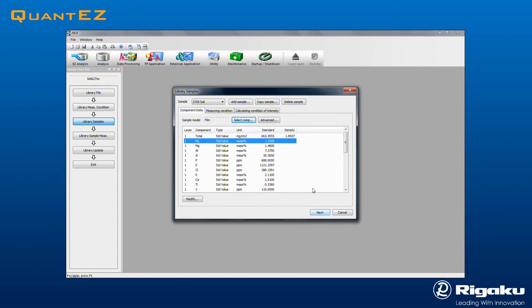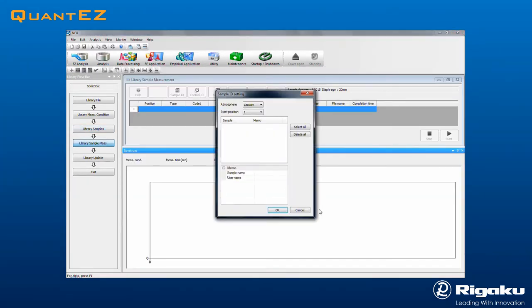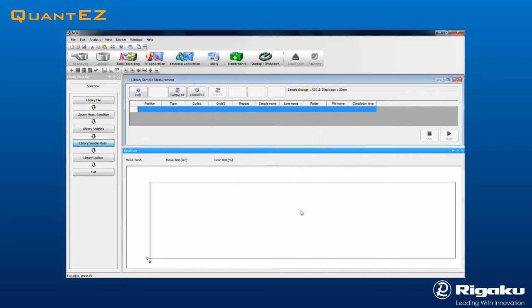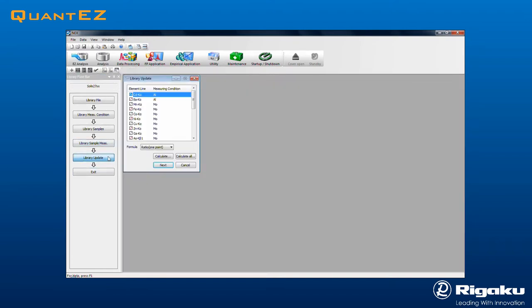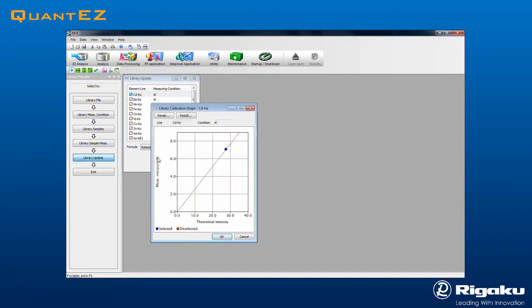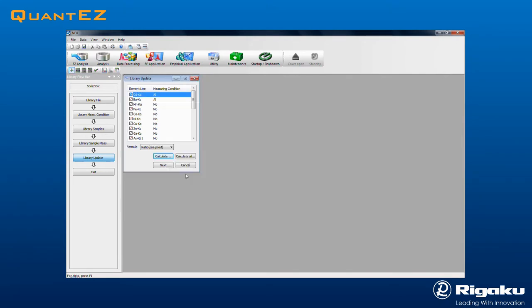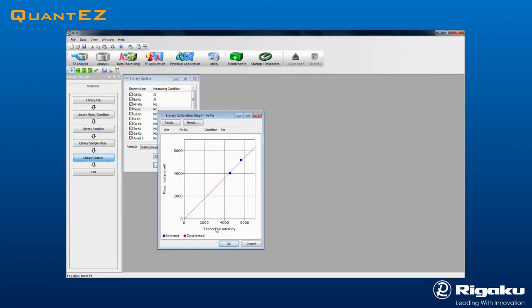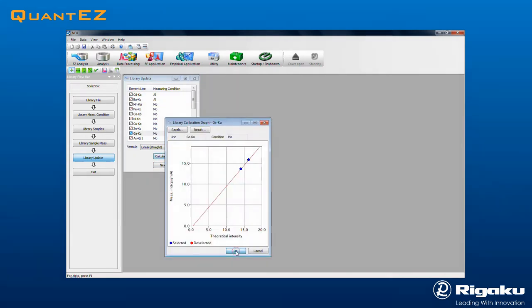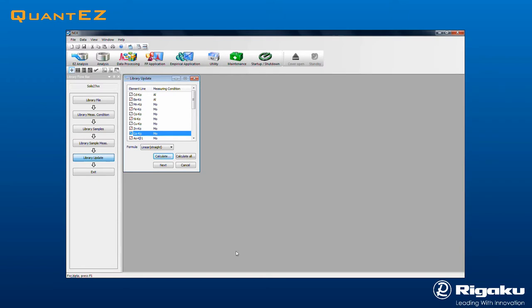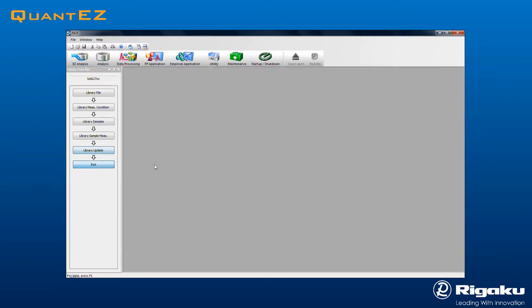Clicking Next brings up the Library Sample Measurement screen. Standards that were not pre-measured may be added here. Click Library Update on the flow bar to examine the results by element. Select an element and click the Calculate button to see the new association that is created between theoretical and measured intensities. Then click OK to exit, followed by Next and Exit to complete.